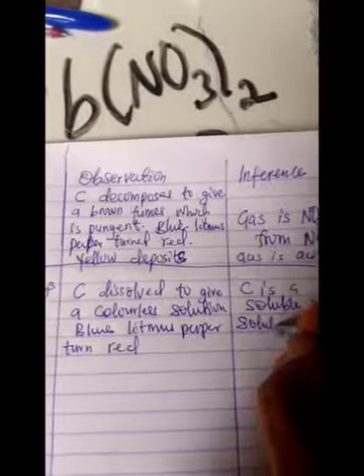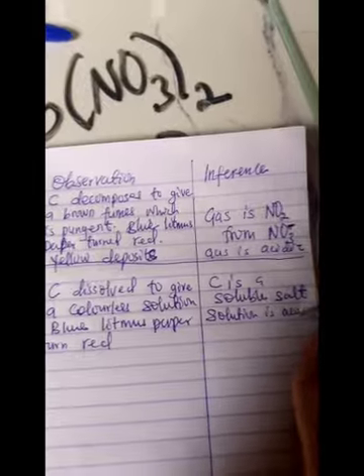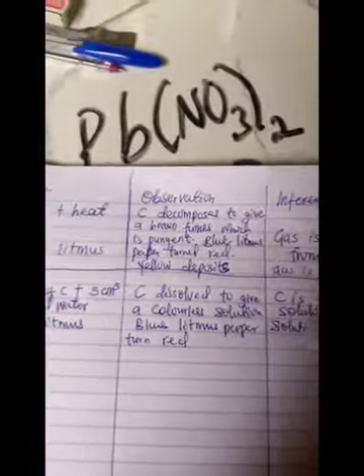Then the observation for the gas turning blue litmus paper to red will also be that the solution is acidic. So now remember, here we used litmus paper to test for the gas, the pH of the gas.